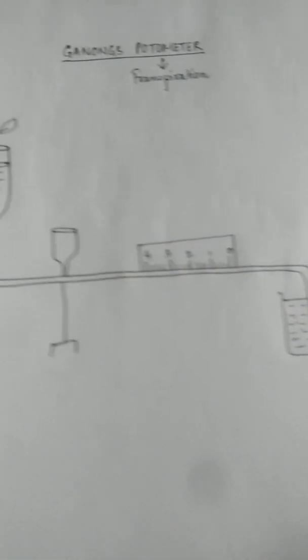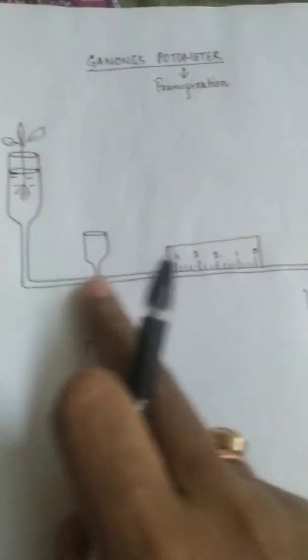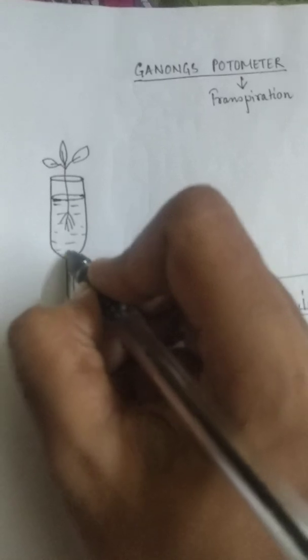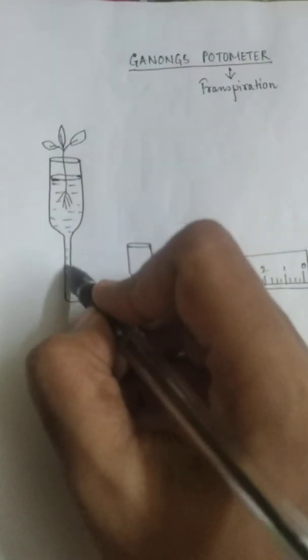Now why have I colored it? That also I will let you know. And the remaining the entire setup of this potometer that is filled with normal water. Normal water means uncolored water.